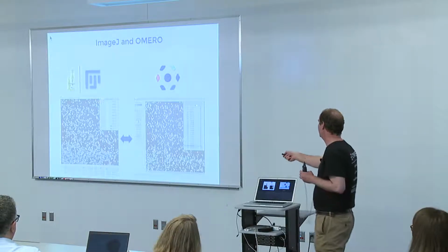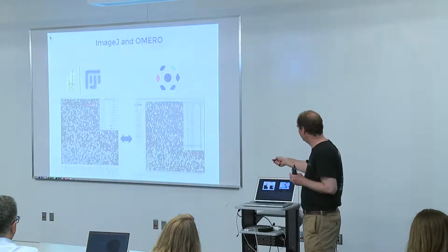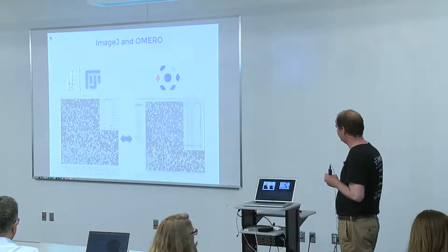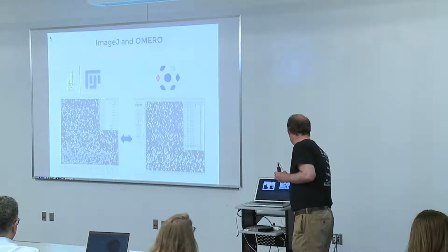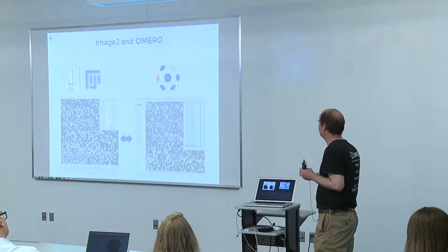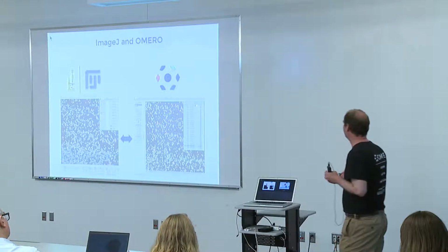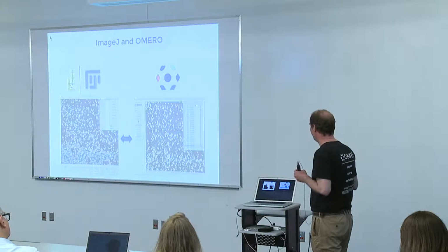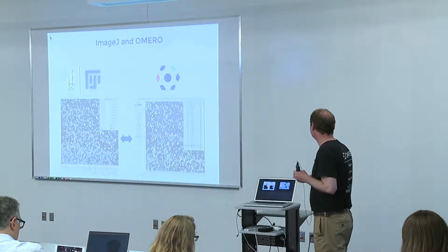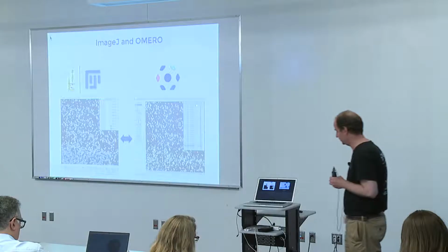From your desktop, threshold it, and create, using the Analyze Particles function, a fair number of regions of interest, and the associated results table. And with two clicks, you can upload the image to the OMERO server, and with this workflow you can, for example, show your data to your boss. The upload will happen of the image to the server also with the associated ROIs, the regions of interest, and the results attached to it, so we will never lose them anymore. And you can, for example, publish the figure very quickly using the OMERO Web application on the internet.